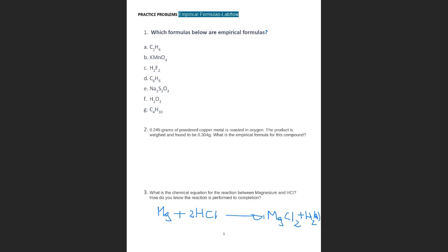And obviously, you know how to write magnesium chloride. But you are going to verify that when you calculate the empirical formula for magnesium chloride, you have to obtain in your report for magnesium a 1 when you divide by the smallest number, and for chlorine, you need to get a 2 because this is the right formula of magnesium chloride.